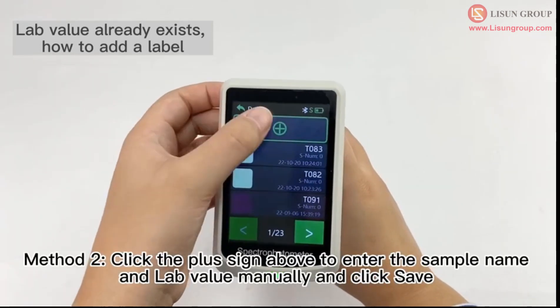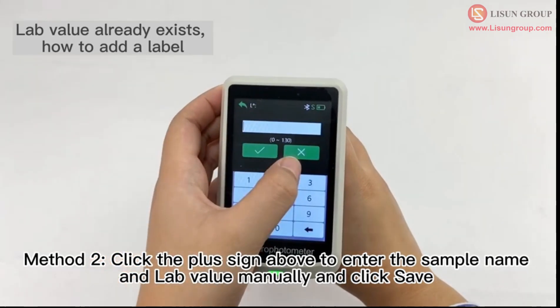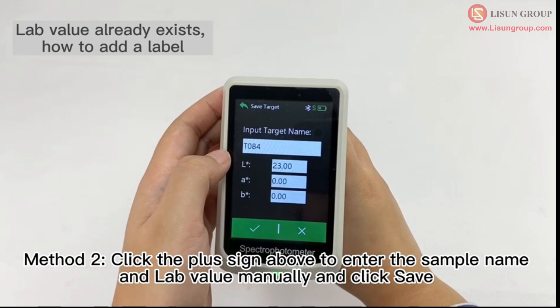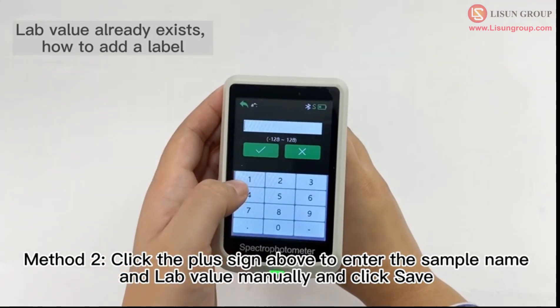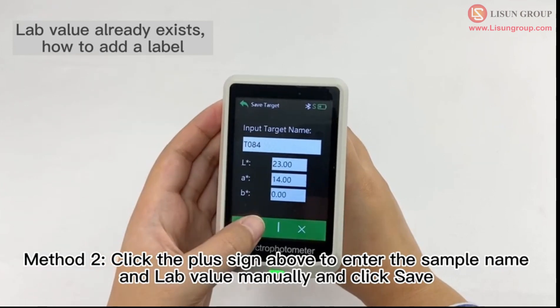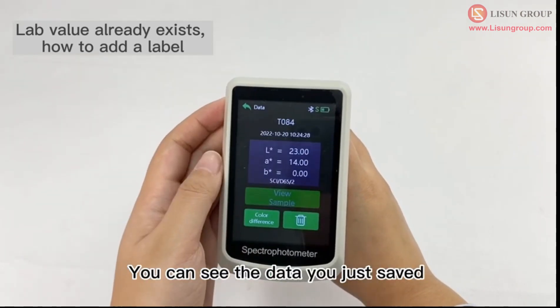Method 2: Click the plus sign above to enter the sample name and LAB value manually, then click save. You can see the data you just saved.